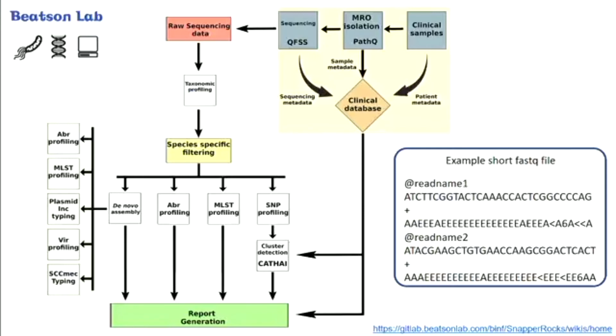This is a typical bioinformatics pipeline. This one's specifically designed for culture-based Illumina data. Once a sample is sequenced, it produces a number of files containing those sequence reads, and these files are called FASTQ files. They contain the string of the sequence, and they also give a bit of quality. So the first step in any pipeline is quality control. We look at how good those sequences are, and this involves cleaning off any bases that have a lower quality score, so we're not really confident that what the sequencer detected is actually what's in there. So we trim those bases off, particularly at the ends of the reads around here. If we're not confident that that is what the sequencer says, we trim them off.